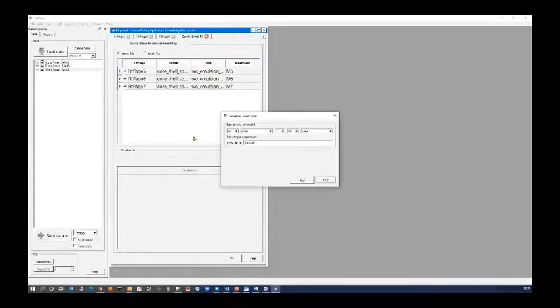neutral constraints. And this is where I can tie parameters between the fit pages together. In this version of the program, it only lets you tie 2 together. We're changing that so that you can do more complex constraints. The way this works is the left-hand side is the child that is learning from the right-hand side, which is the parent.